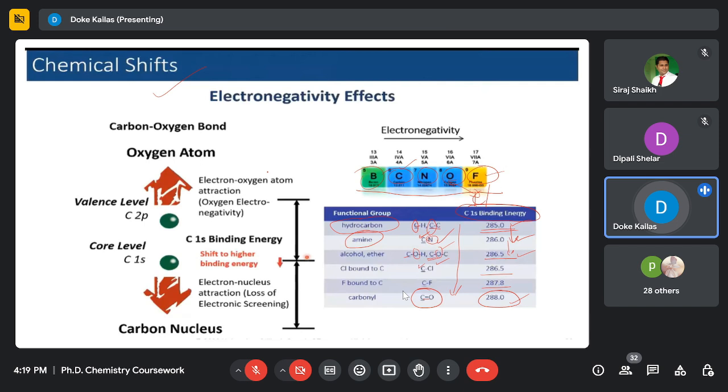When we record high resolution XPS spectra, you will interestingly observe three different intense peaks, because the polymer consists of a large number of each of these carbons. Each carbon emits electrons, and the electron intensity of each carbon will be higher, so more intensity will be observed.